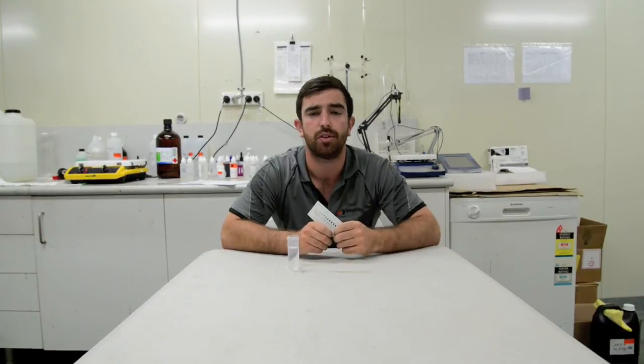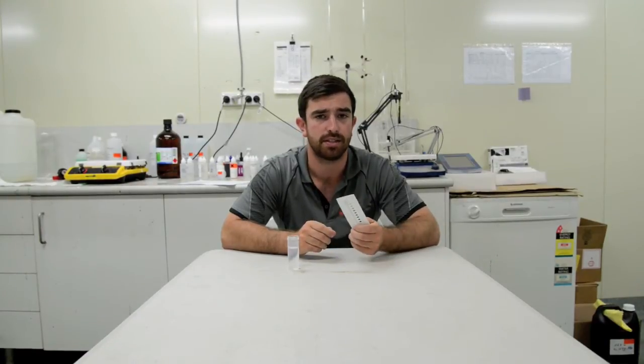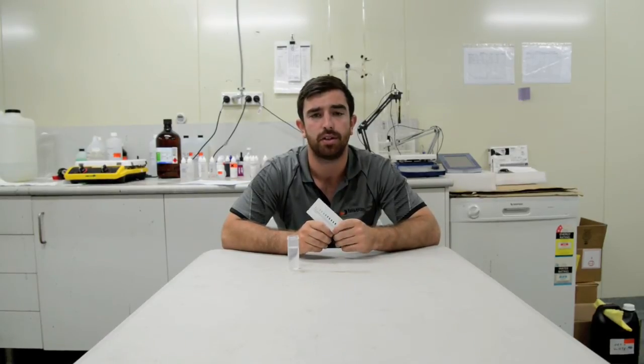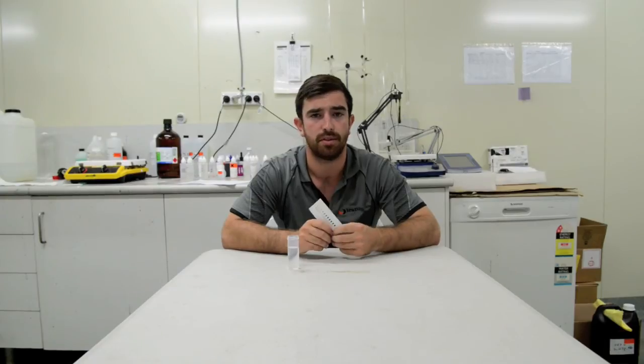You can find our free chlorine test strips in many of our test kits and can also be purchased separately. There are many different people who use our free chlorine test strips for many different reasons.